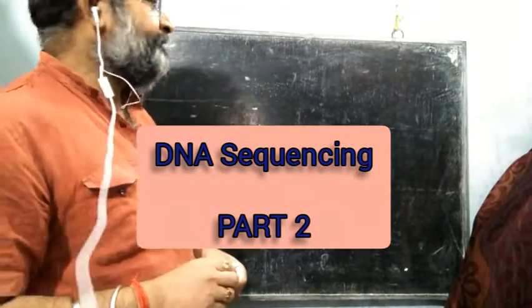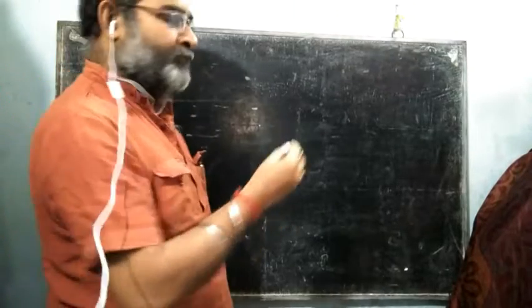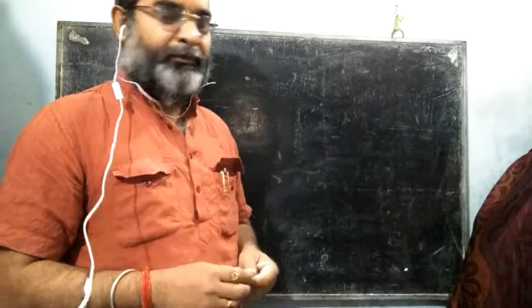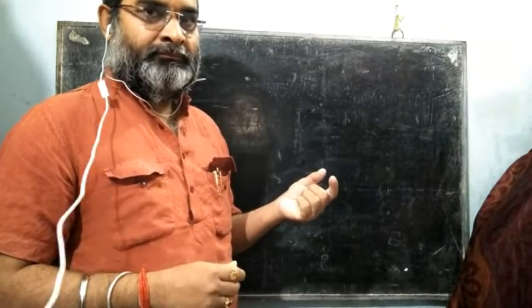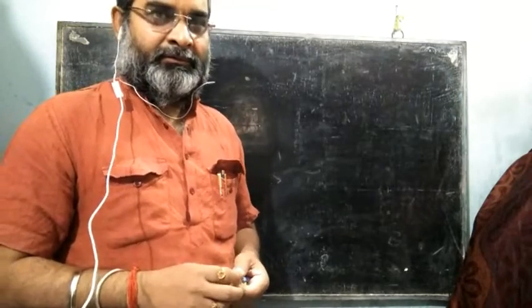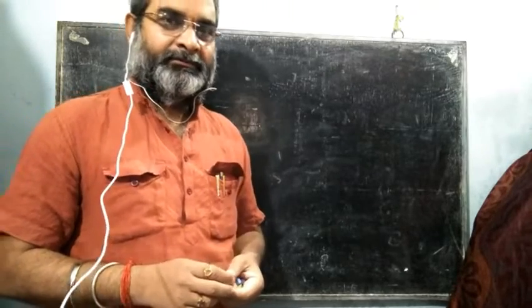Now in this class we are going to talk on the next part of DNA sequencing. At first, before coming to today's topic, we want to analyze the bands of the previous class again, because some students communicated to me that they have no proper understanding of the analysis of the data.